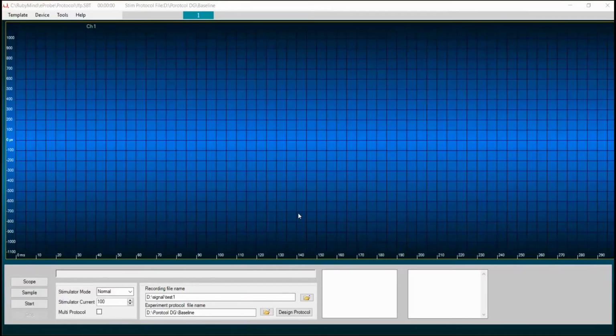In this film, we want to teach how to record LFP signals, local field potentials, by the devices eLab, ePulse, and the software eProbe. Installation of the software has been taught completely in the other film. Now, we want to teach how to work with the LFP protocol.